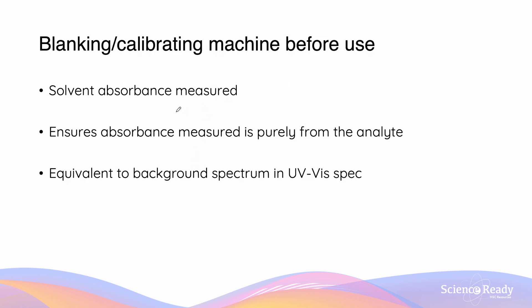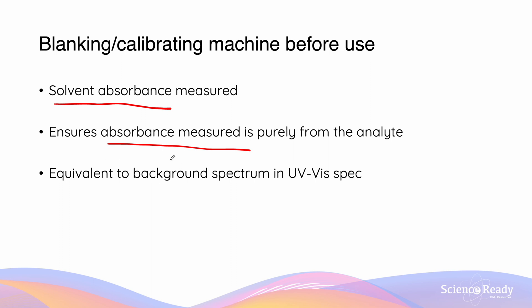Before we use our colorimeter, we are going to blank the machine by filling up the cuvette with the solvent used. This solvent absorbance is then measured. The reason why we blank the machine is to ensure that the absorbance measured is only from the analyte — meaning that if we have any impurities in the solvent, we'll be able to remove their absorbance from the absorbance of the final solution. Blanking a colorimeter is equivalent to doing a background spectrum in the UV-Vis spectrometer.